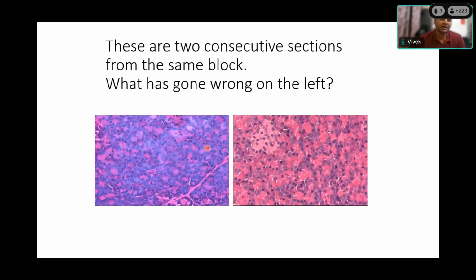In staining, you don't have any temperature. You usually do it at room temperature. So there's no question of temperature. So it should be either the wax has not been removed, I showed you, it looks very much like that. Or at the end of staining, you have a step called clearing, xylene. After you take it through water, you have a step called dehydration and clearing. So when you don't dehydrate and clear at the end, you have stained, you finished your eosin, you come up to the last stage, and you have not gone through your final steps of dehydration, a dip in xylene before you mount.